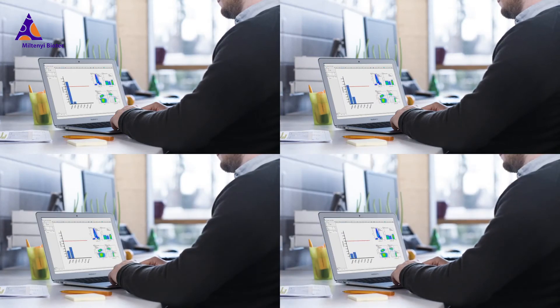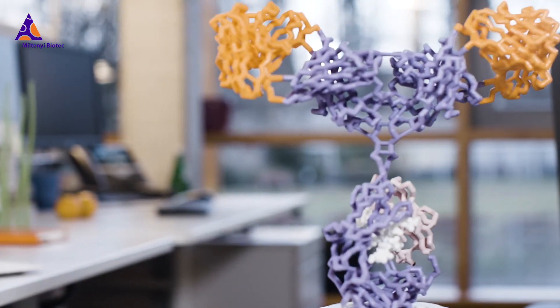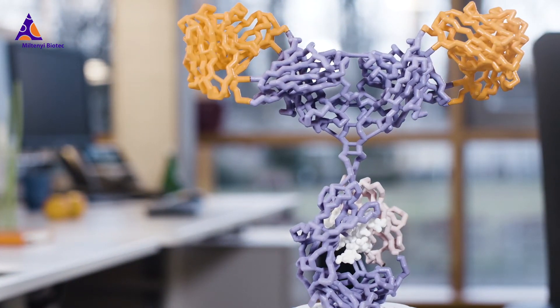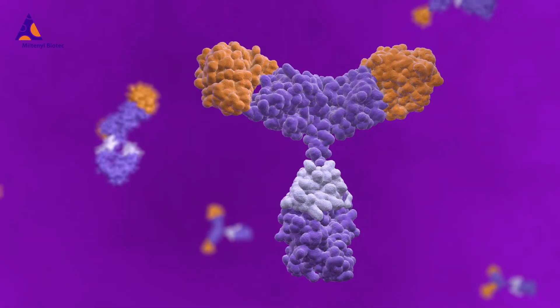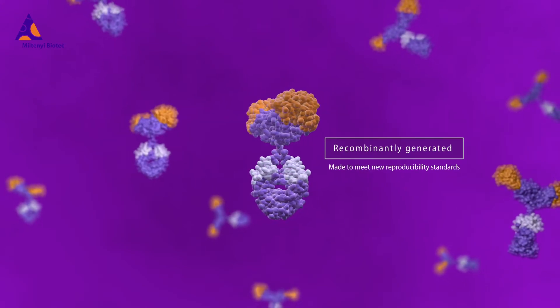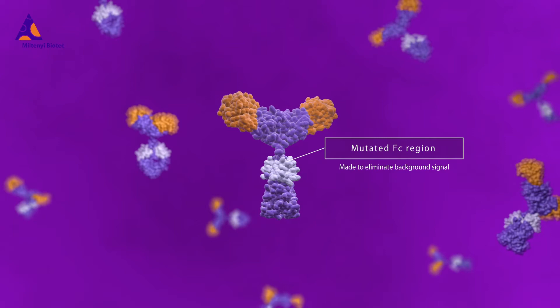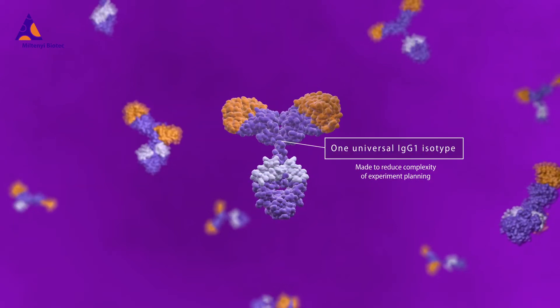Nevertheless, being derived from conventional antibodies, common cocktails do little to solve reproducibility challenges. Luckily, not all reagents are the same. Miltenyi Biotec created recombinantly engineered antibodies to address exactly that problem. Recombinant technology ensures high purity of antibody clones, reduces background signals, and provides superior lot-to-lot consistency.